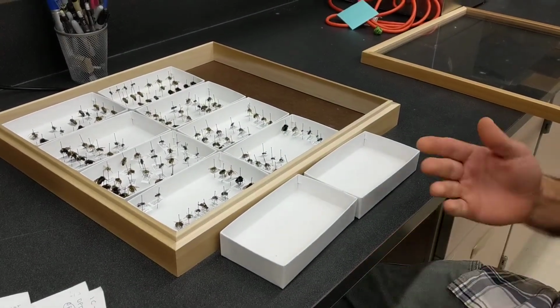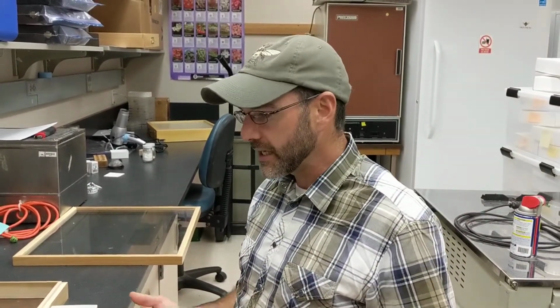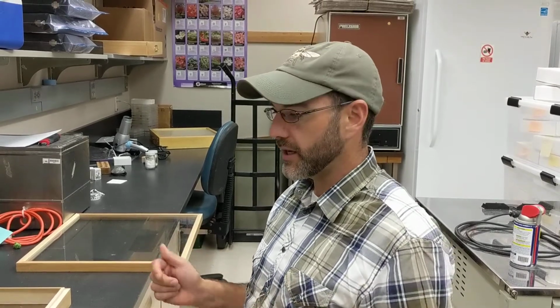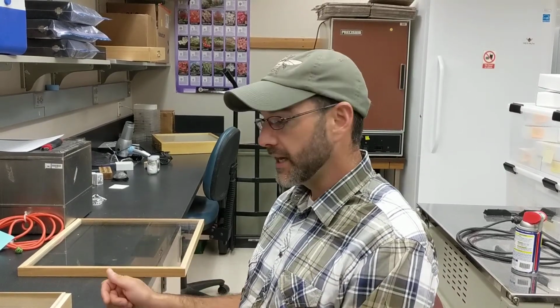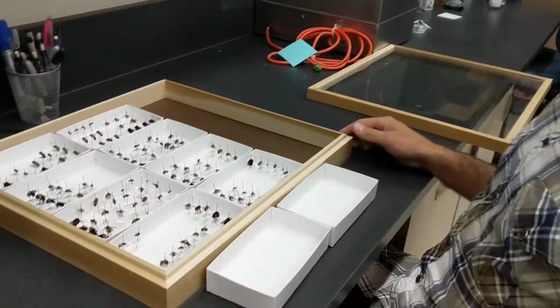Now, how you do this will depend on how much experience and knowledge you have about all the different bees. If you're just beginning, your results will be coarse, and if you have years and years of experience, a lot of these you can sort immediately to species because you'll know what they are. So what I'll do is choose a couple of basic characters that I can see by eye, and I'll do it that way. So come on in here and take a look.